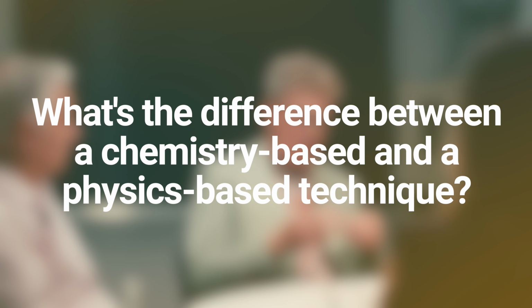I think another factor that kicks in there as well just reflects the difference between a chemistry-based technique and a physics-based technique like PhotonAssay. With chemistry, where you're having to go much further on your sample prep, you're having to pulverize, there are concerns around contamination and crosstalk between samples. You often hear that you really shouldn't be using data if you're much less than, say, 10 times the detection limit.